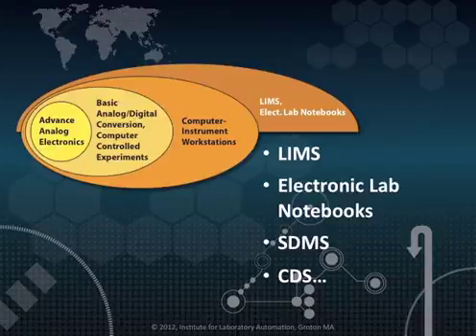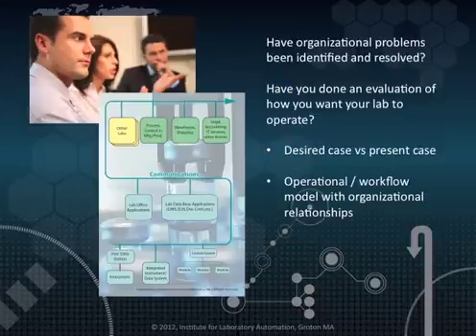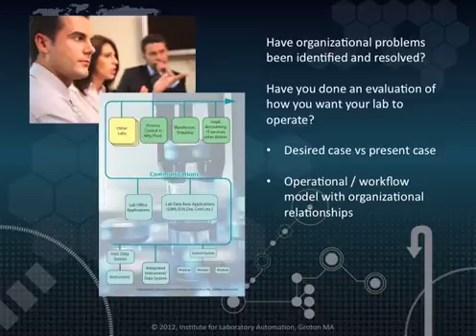Laboratory informatics is no longer an option in modern laboratories. It is a requirement. Meeting that requirement takes a lot of planning, training, and support. Before you attempt to satisfy the laboratory's need for informatics solutions, make sure that the organizational problems have been solved. Get the politics out of the system.